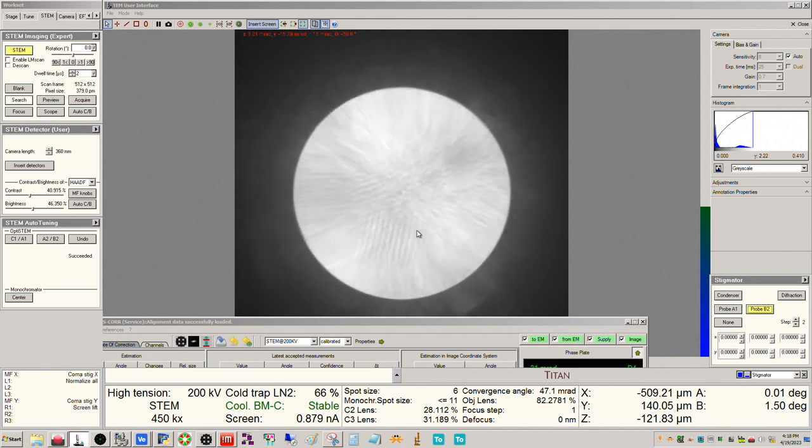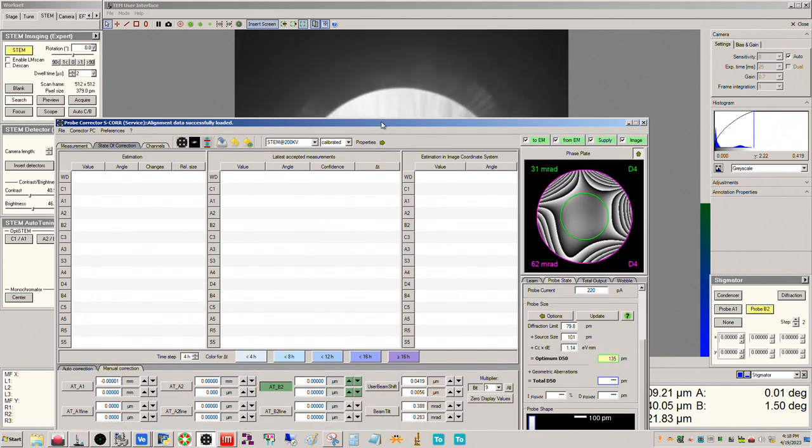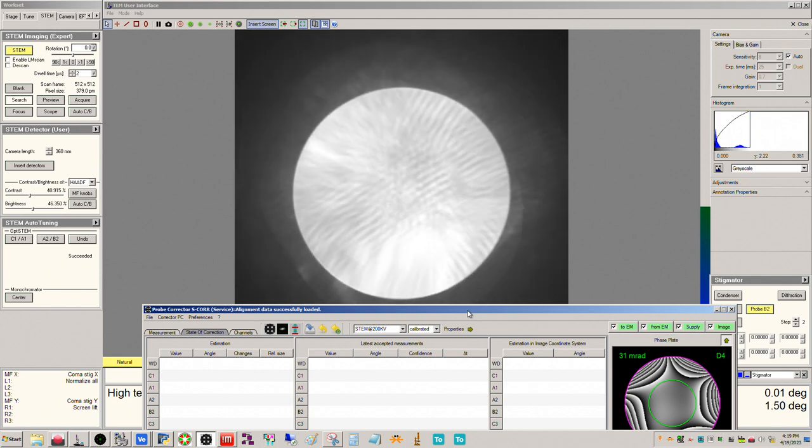All right, so there's a little bit there. Not a whole lot, though. But we'll go ahead and fix this. So it's kind of going a little bit left to right. So that's up, down with the arrow keys.